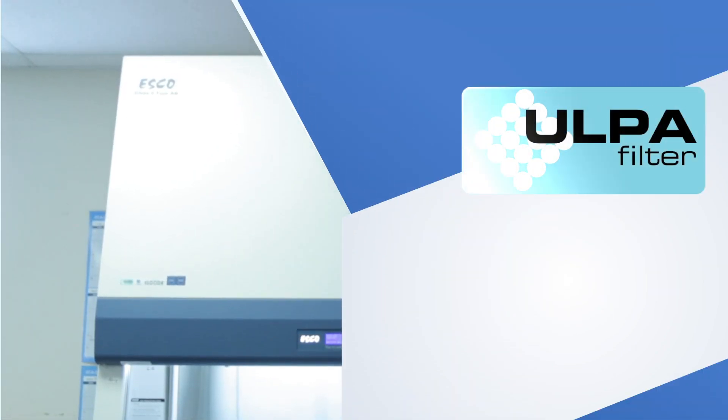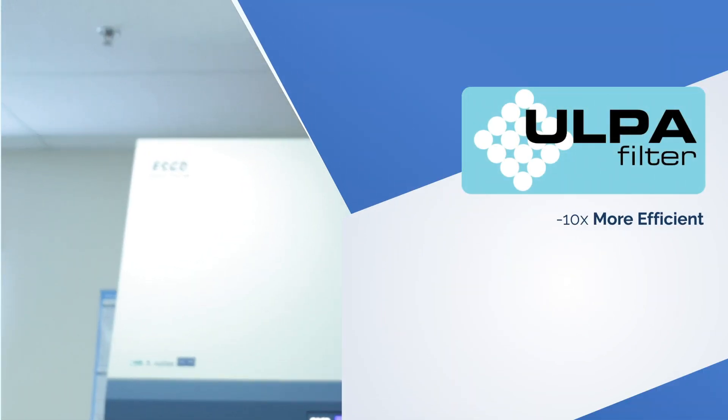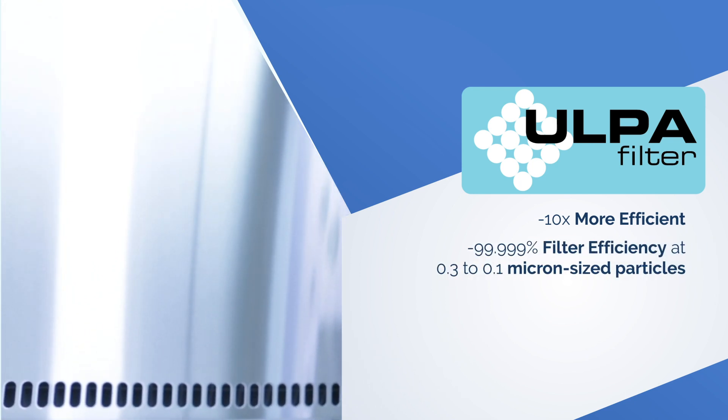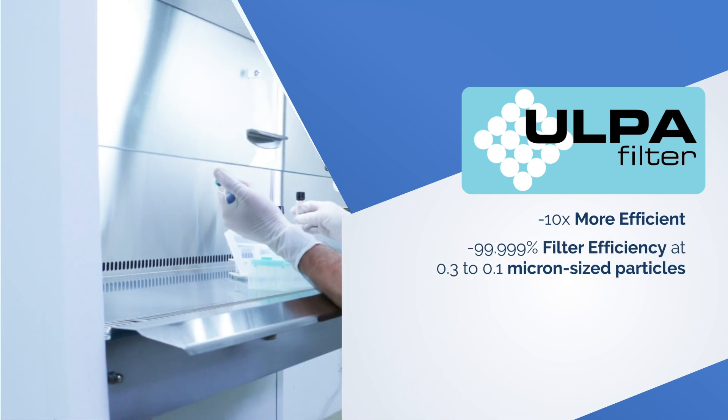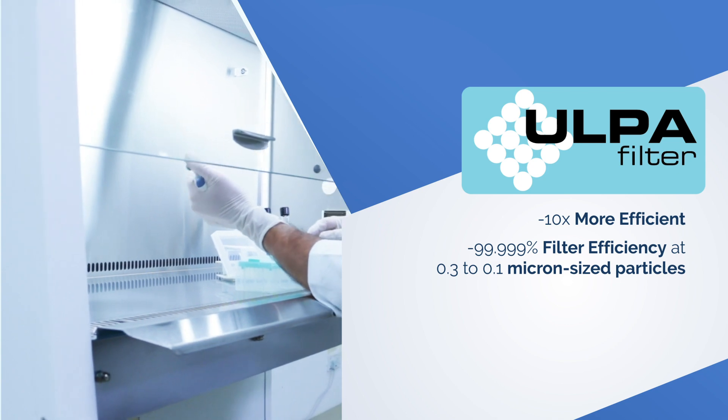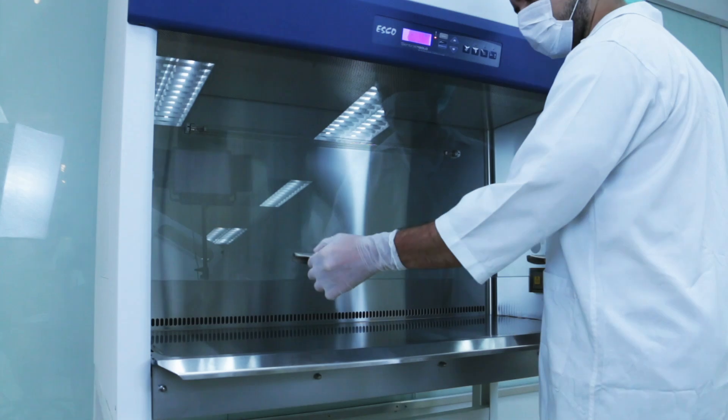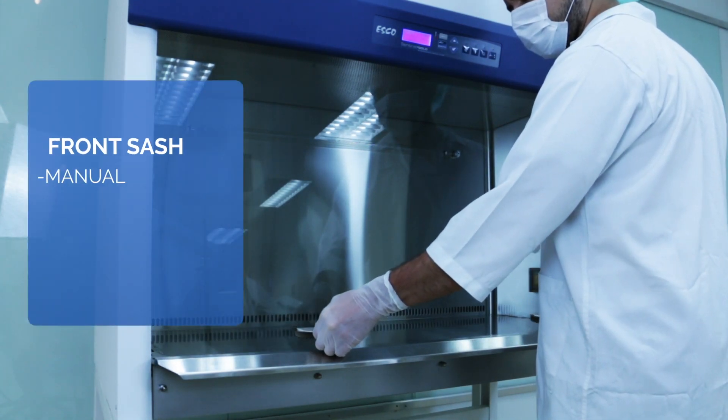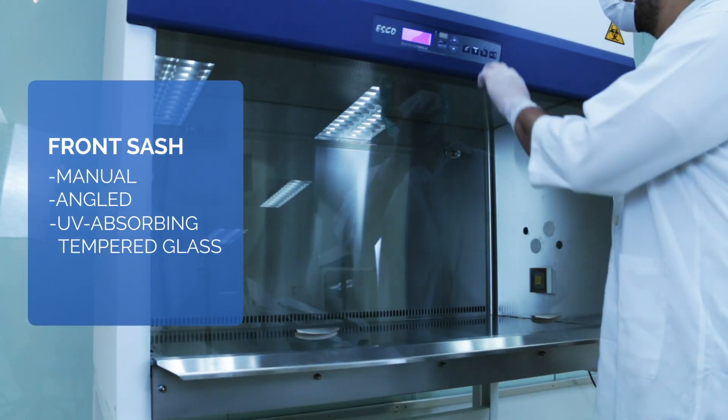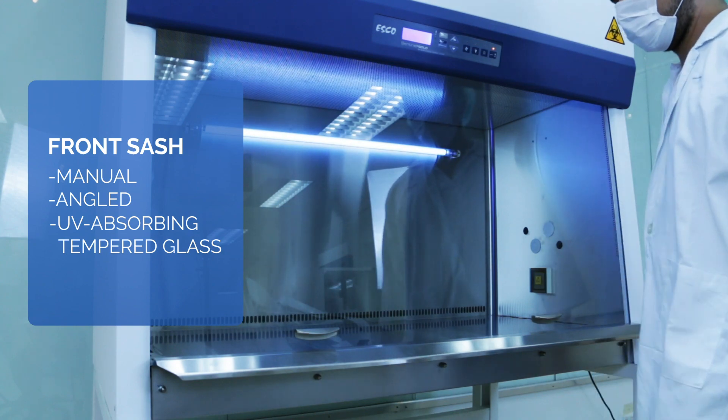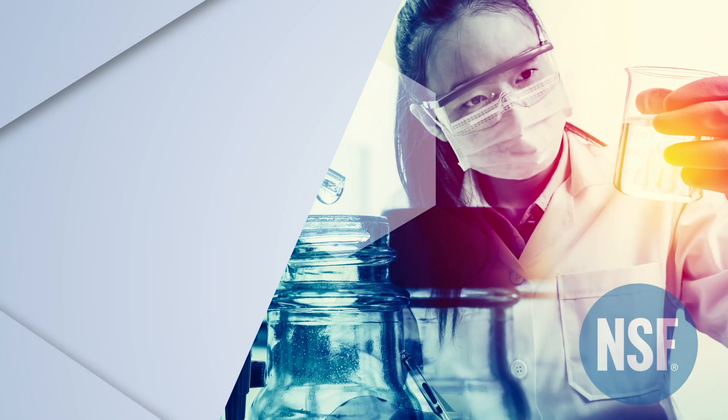Esco Biosafety Cabinet uses ULPA filtration system having 10 times more filter efficiency of 99.999% at 0.3 to 0.1 micron sized particles versus HEPA filter. Its manual angled UV absorbing tempered glass front sash can be operated even during power failure.